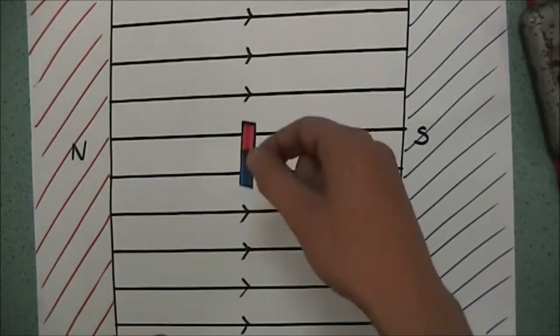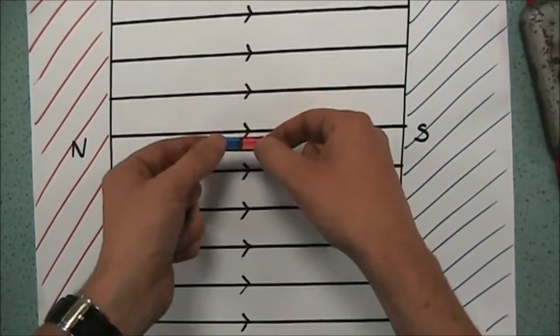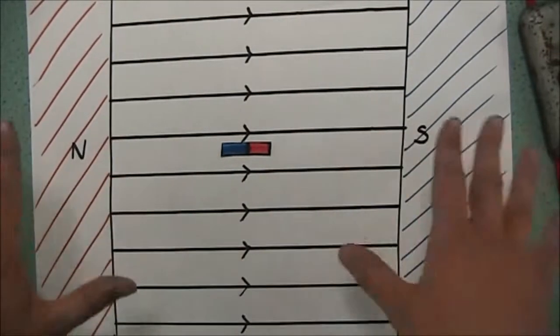on a molecule. I'd like you to imagine that I have a magnetic field north to south, and I'm going to put in the middle a bar magnet, and the bar magnet will attract to the magnetic sides.